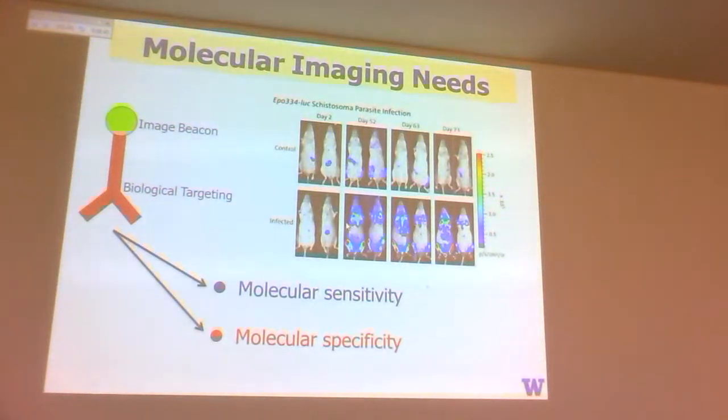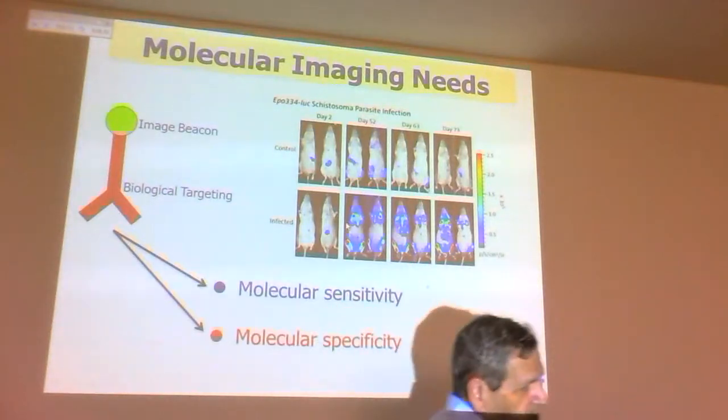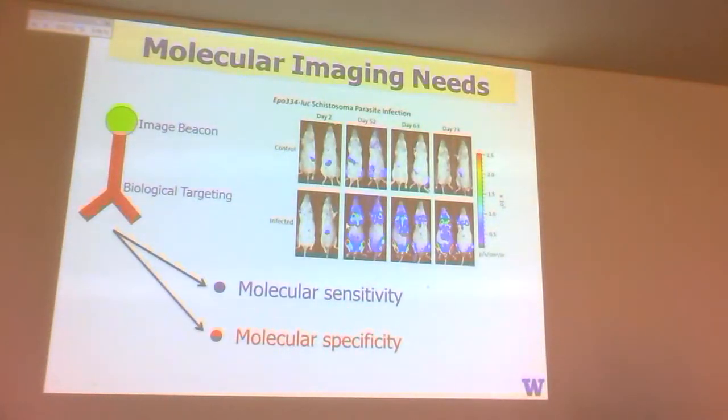So what's the autofluorescence, and can I separate this based on whatever signature, however you're going to process the data, so that you can have a one-to-one correspondence between the brightness you have in the picture and the concentration of that agent.